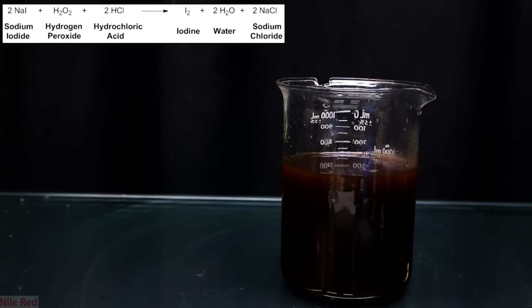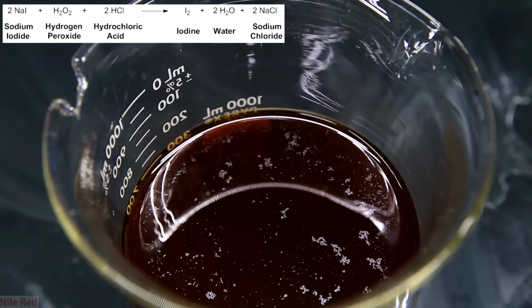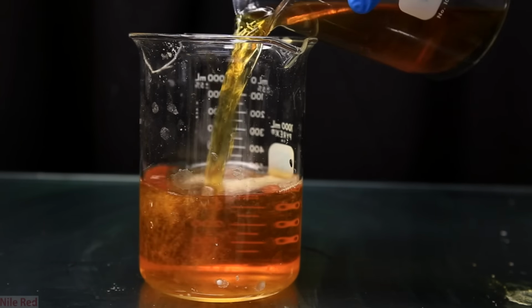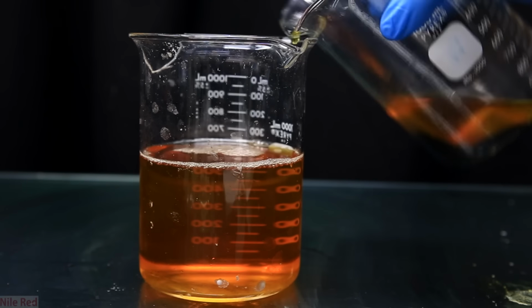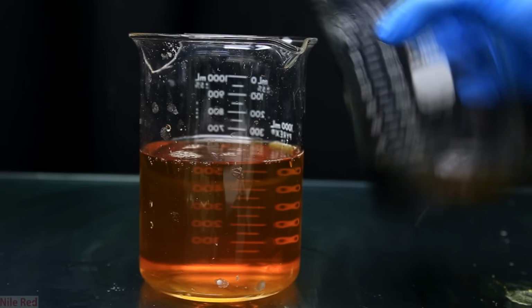Immediately once it's added, it takes on a very dark red color, but then it starts to get cloudy. This cloudiness is due to elemental iodine being produced and precipitating out. I let it sit for a bit, the solution totally cleared and all of the iodine sank to the bottom. I then decanted the upper aqueous layer.